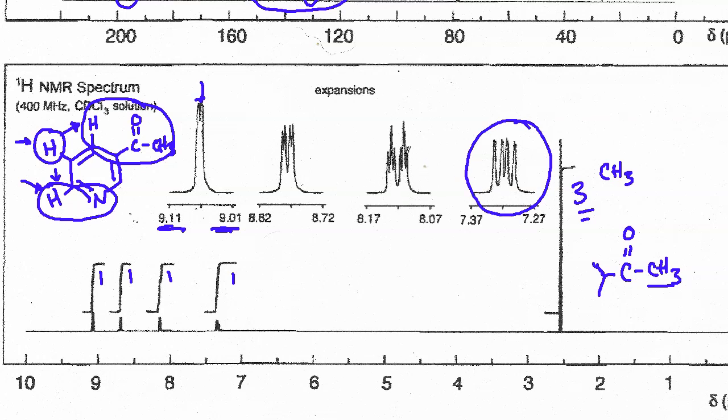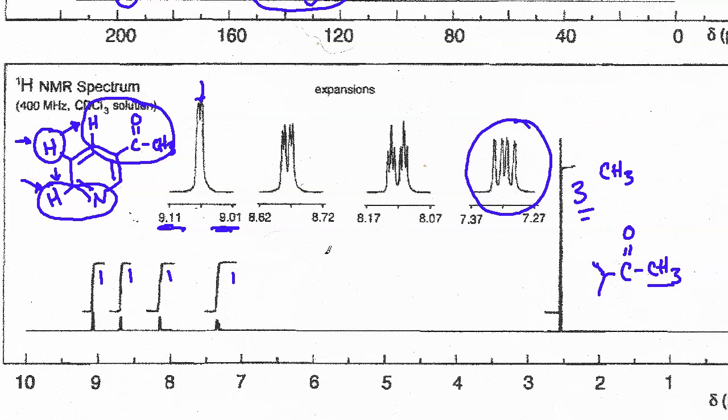I don't want you to get too caught up in every single one of these. However, it can become important when you start trying to determine where the rings are going to be substituted in terms of splitting patterns and stuff like that.